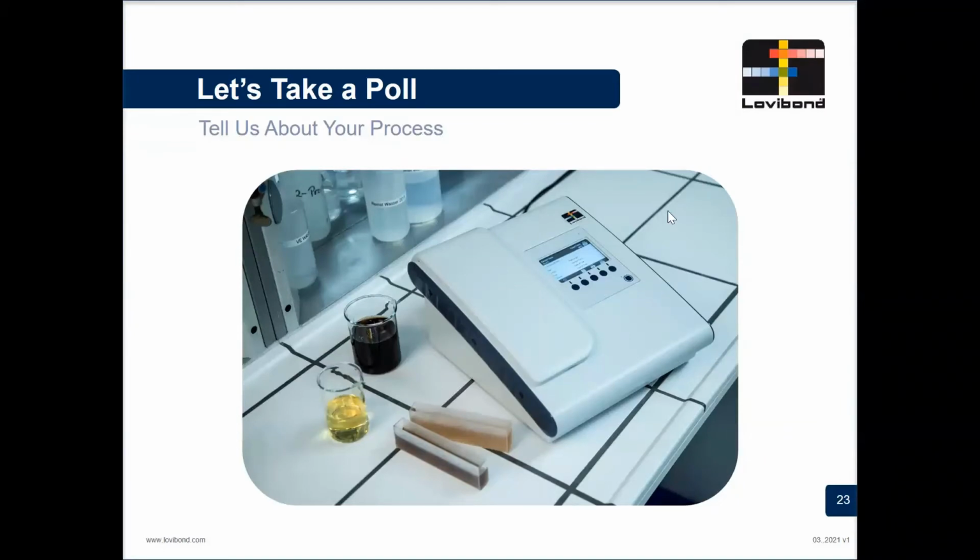Peter, have you got any comments on the poll? Yes, it's good to see that a lot of you are bothering to heat your samples, because that can be quite important. And on your path lengths, I'm going to be talking about a lot of these points in the next few slides, but it's good to see that some of you are using different path lengths depending on what you're measuring, and you're not sticking with the 5 1/4 or the 1 inch.